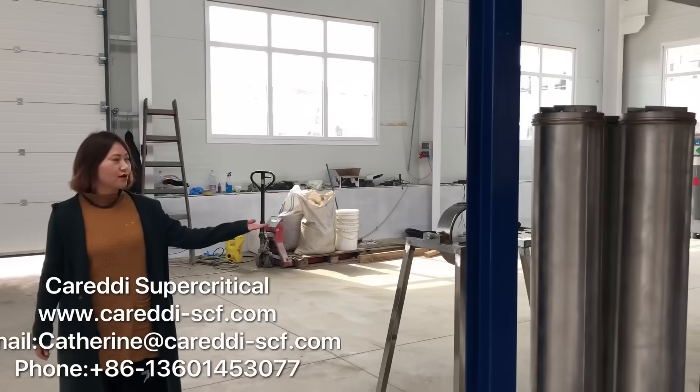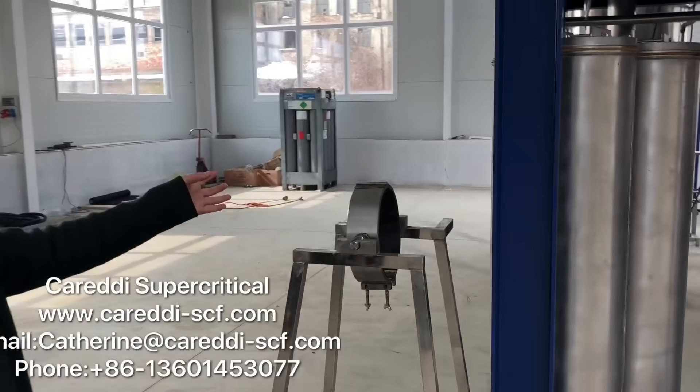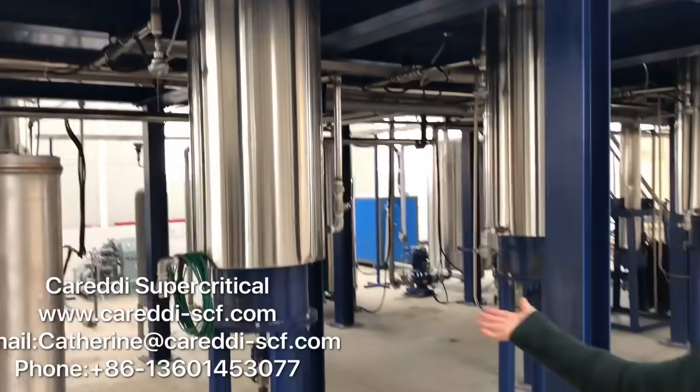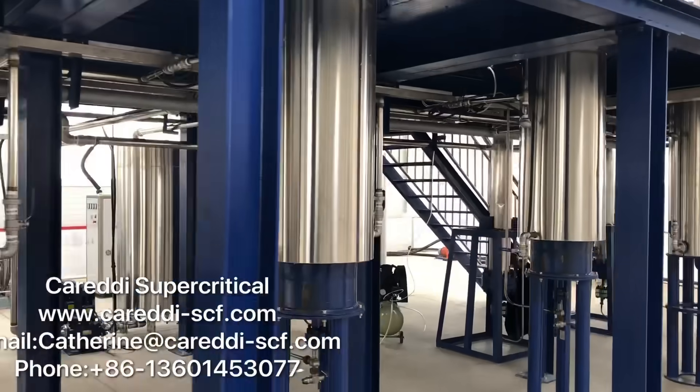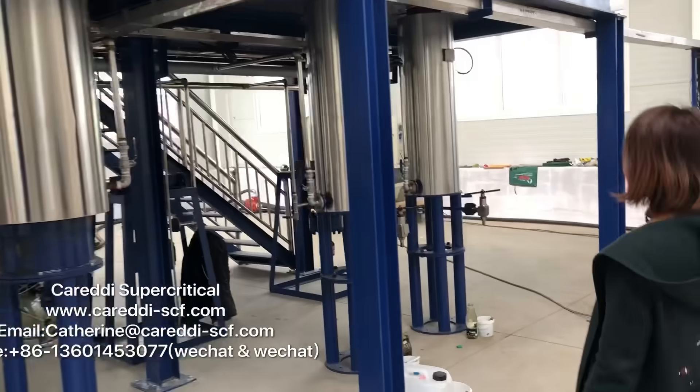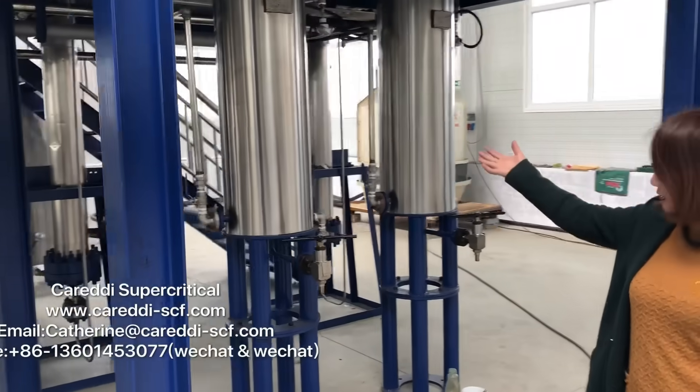Here is the loading and discharging area. This is the loading vessel. This is extractor 1, extractor 2, and extractor 3. This is separator 1 and separator 2.